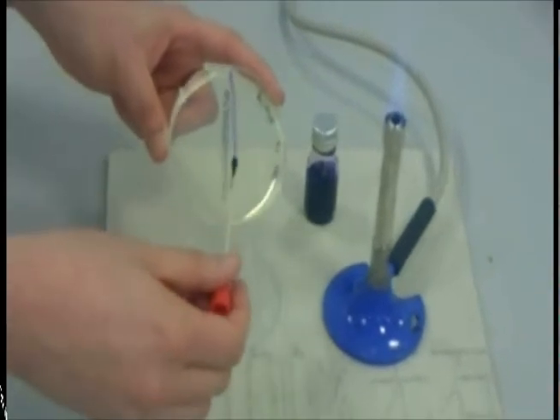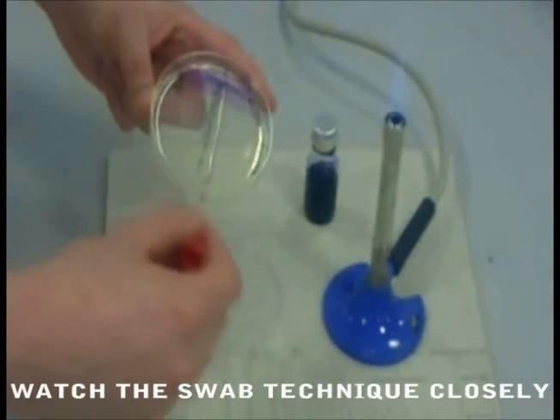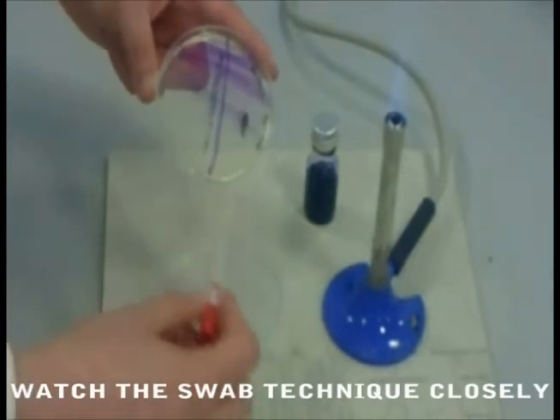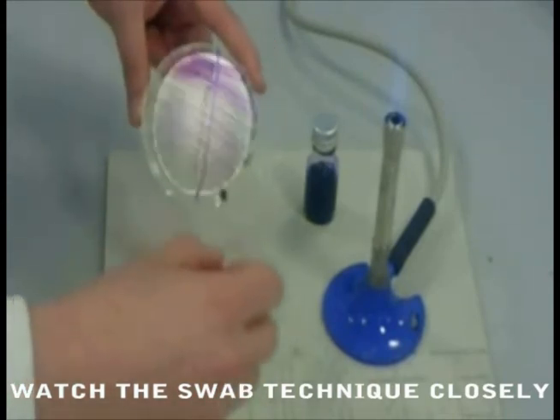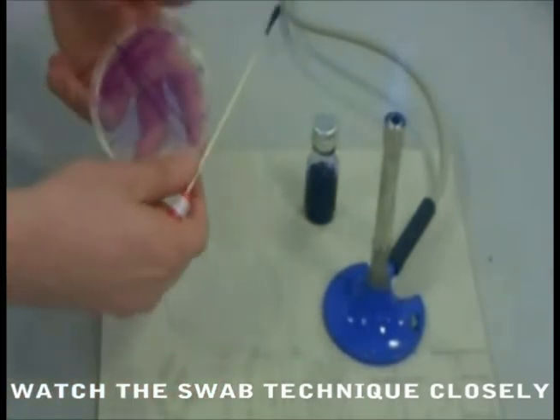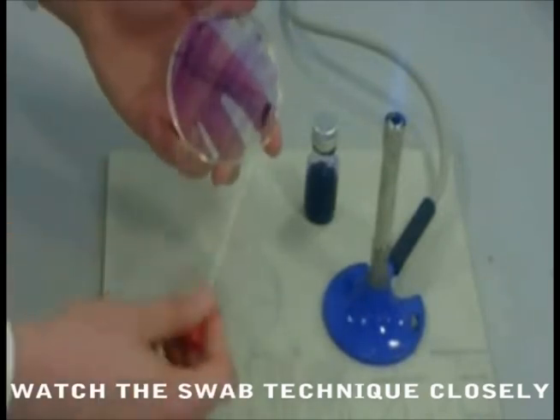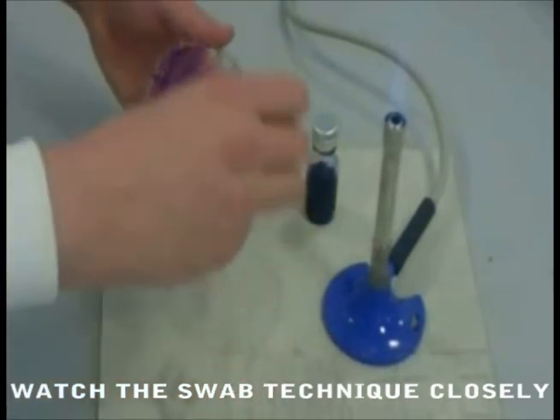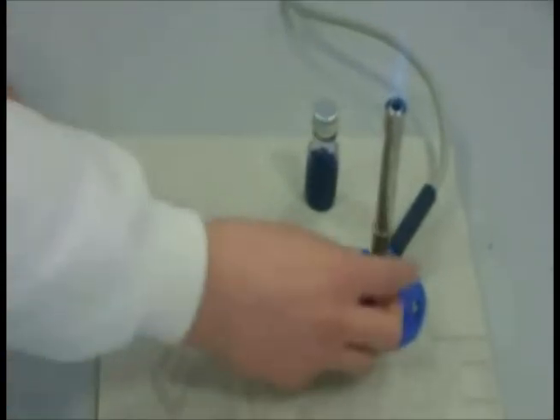Start by drawing the swab straight down the centre of the plate as illustrated in the video. Then, rotate the plate 90 degrees. Proceed to carefully streak the swab across the first streak, snaking down the plate as close as possible to ensure adequate coverage with your sample. Once completely across, rotate the plate another 90 degrees and repeat this motion to completely cover the plate. Finally, to finish, draw the swab gently around the circumference of the plate and place back on the bench. Dispose of the swab safely by immersing in Virkon solution.